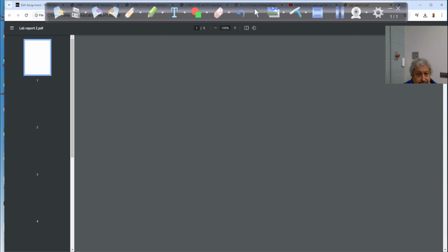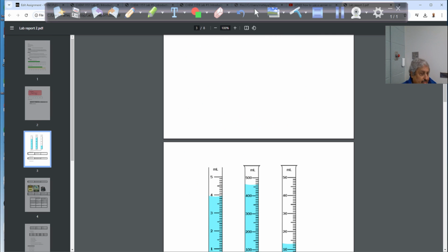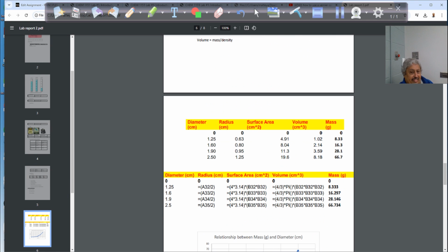Okay, this is one of the students'. I think I gave you one in the lab reports, but I did not like the sphere data. These students came out with very good data. So here it is. I'll give you this data as well. You can look into that.